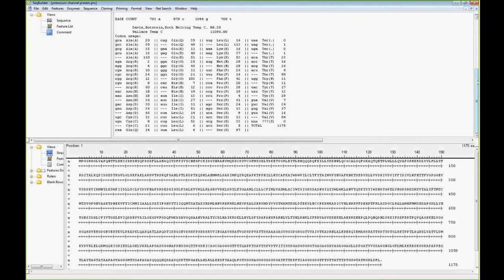Okay, Brian, you thought you were going to escape with just that final question, but we actually have one more that just slipped in. Is there any way to set parameters when you're doing the cloning workflow regarding the primers? Can you change their melting temperature, %GC, things like that?